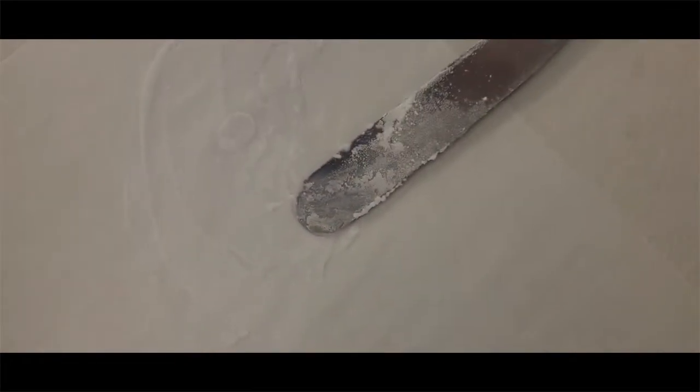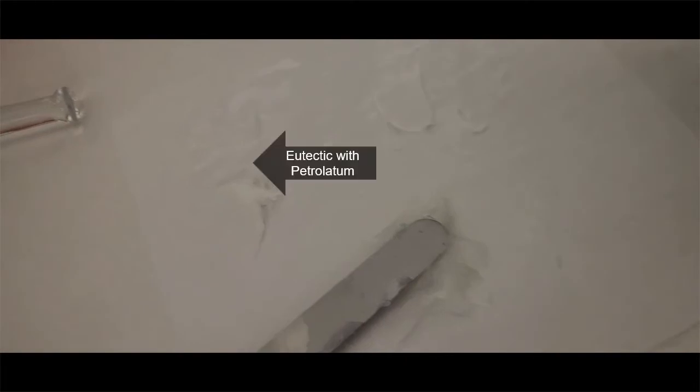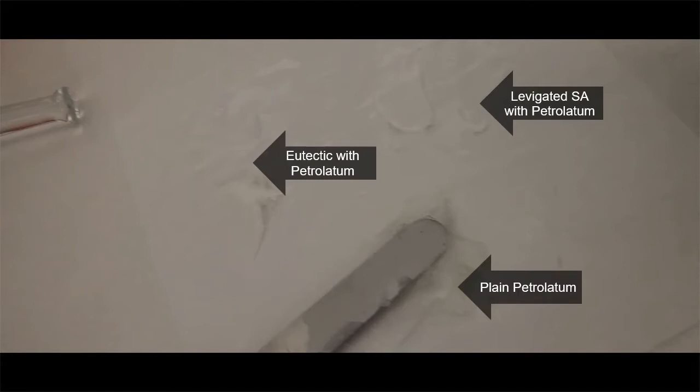So I'm going to again take another about a third of that white petrolatum that I have in the pile directly in front of me and I'm going to incorporate that. So right there, I'm taking some of that and I'm going to incorporate that into there. So now, ultimately, I'm going to have three piles in front of me. I'm going to have one pile that has the eutectic with petrolatum. The other pile has the levigated salicylic acid with white petrolatum. And then I have another pile just plain petrolatum.